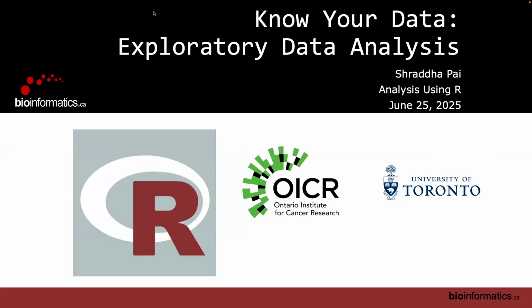As I've said, with genomic data analysis, you have a variety of flavors of assays that measure different molecules in your biological context. And with genomics, we can do all of the molecules together, all of the species together. Each genomic assay is going to have its own underlying statistics. So you need to make sure that the analysis tools you use are built for that kind of data.